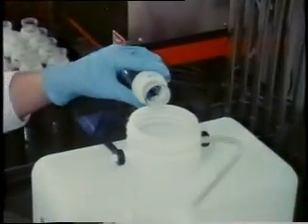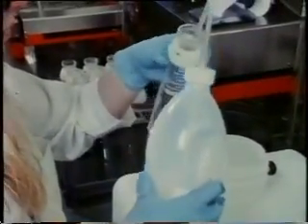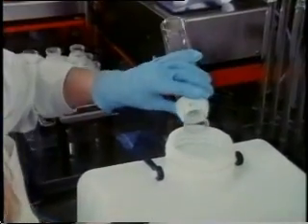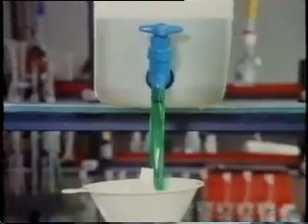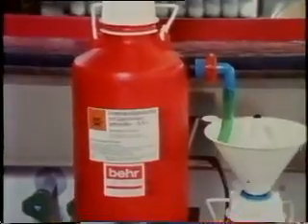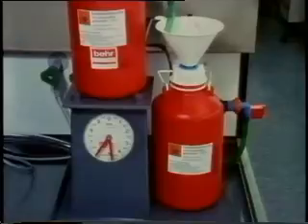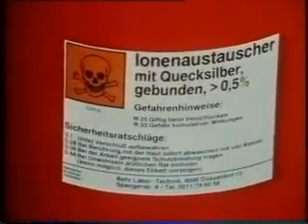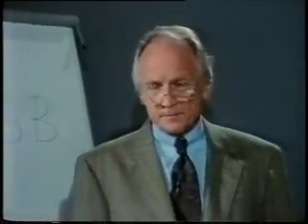The titrated solutions are collected and diluted with water. The silver and mercury compounds they contain are removed with the Berosorb. This process is specified in the German DIN standard 38409 part H41.